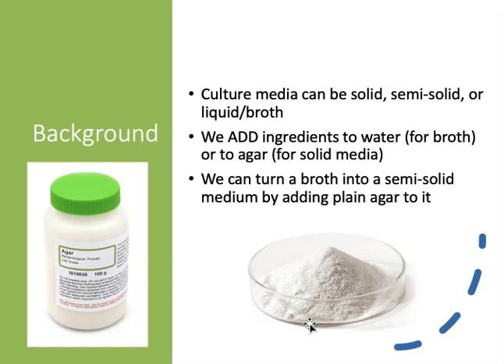What makes it such a nice medium is the fact that it stays solid at a range of temperatures, including the high temperatures that we sometimes use in the incubator. And it's not digestible. In other words, the vast majority of microbes cannot digest agar as a nutrient. They'll grow on its surface, but they're unable to break it down and use it for nutrition.